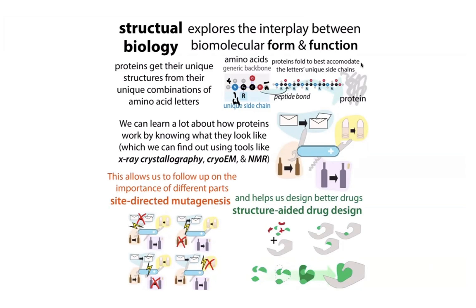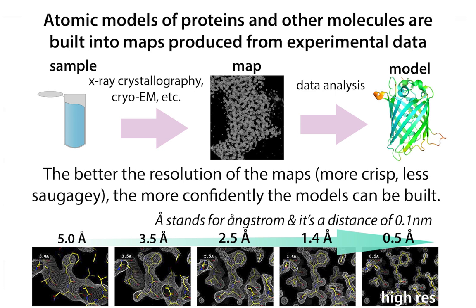It uses techniques like X-ray crystallography and cryo-EM and NMR, as well as modeling techniques like AlphaFold, in order to figure out the molecular arrangements of molecules like proteins and even complexes of proteins and nucleic acids and all these cool things. Basically, that's what we mean by solve a structure.